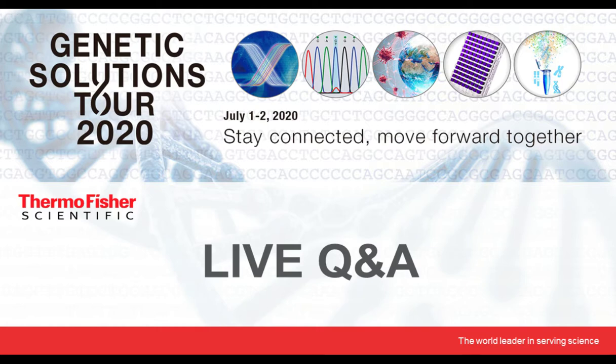Thank you, Steve. Our second question is, what you are presenting here is about human cell lines. Is it true for other animal species cell lines as well? Absolutely. Any cell line you take out of an animal and grow in culture will be subject to the same sorts of genetic drifts and possible contaminations that human cells are. And there are STRs for the various different organisms that can be used in a similar way.